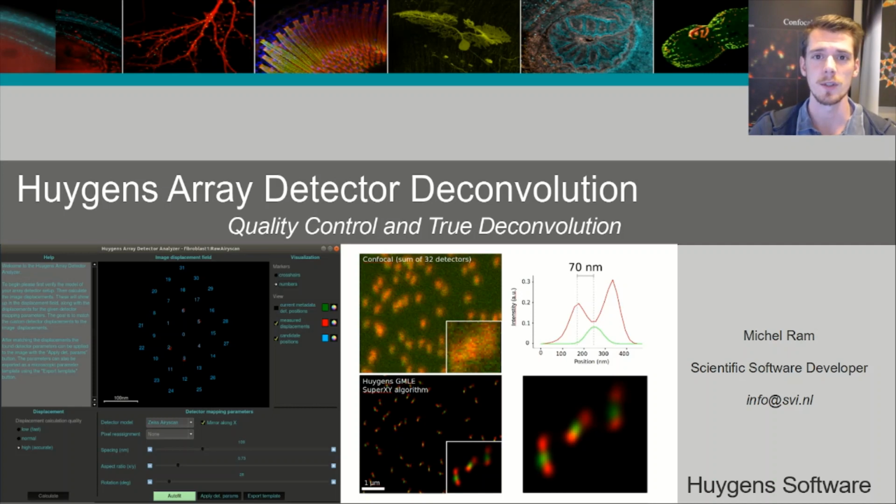Today we will discuss the Array Detector deconvolution option available in the Huygens software. If at any point you have questions during this webinar, you can send them via email to info@svi.nl. With that said, let's get started with the webinar.